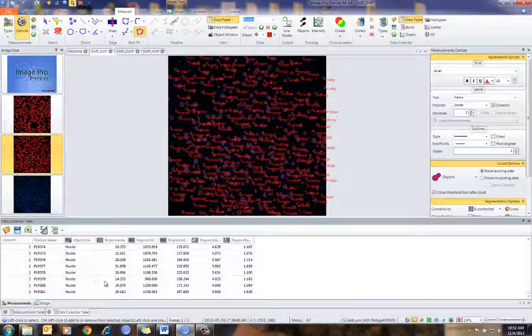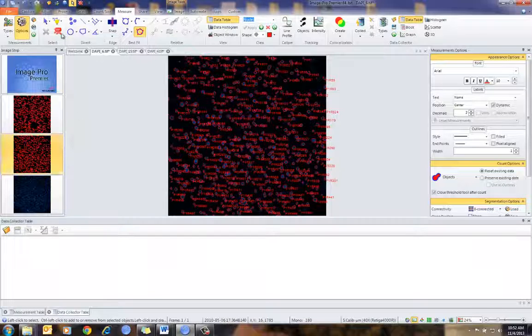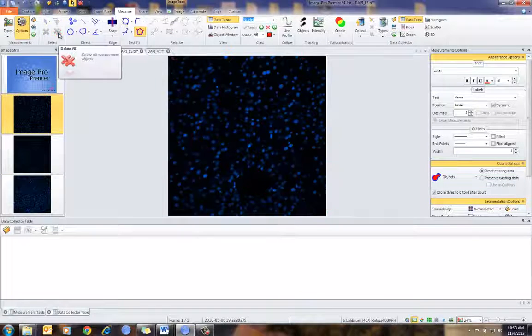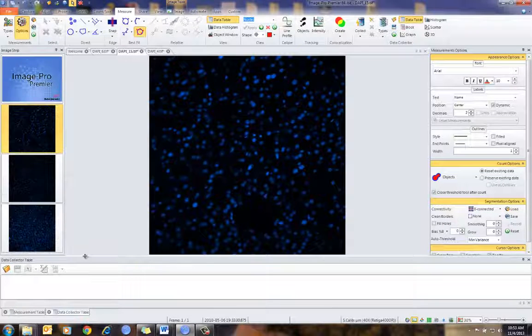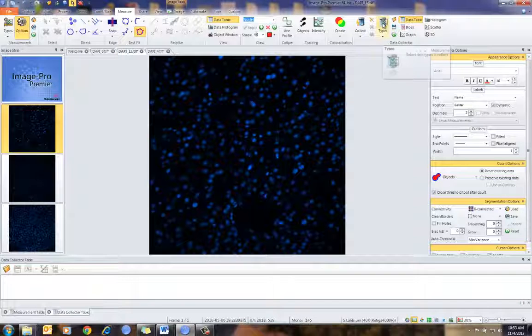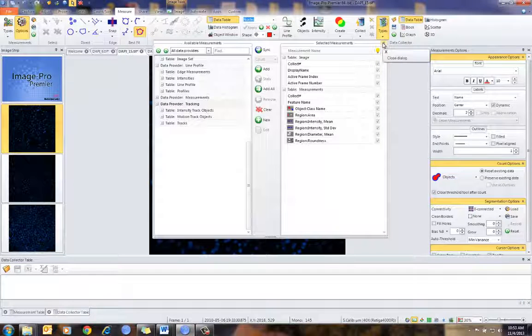There's also a simpler way to do this. I'm going to clear the data out again — you can automate this process. I'm going to clear out all of my counted nuclei or objects and take advantage of the automatic collection. I have my measurements table set up with all the data I want to accumulate from each and every image that I count.